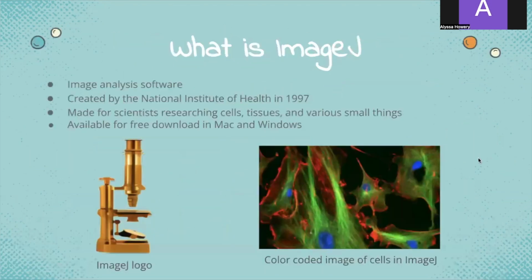So, to start us off, I'm sure you're all wondering what exactly is ImageJ? Is it a coding language? Is it a camera? Well, it sort of is like a camera. So officially, ImageJ is an image processing software. And simply put, that means it helps users look really closely at contents within an image, and it allows them to manipulate it in all sorts of really cool ways.